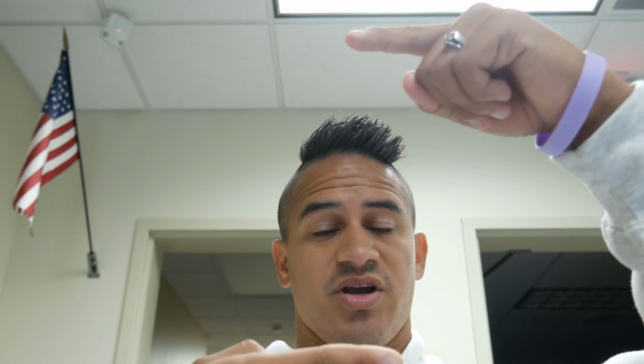So all of these, to be honest, would probably work just fine, but the best one would probably be a 10 milliliter graduated cylinder, because 10 milliliters is about this big, and each little marking on there is going to give you a lot closer measurement to 8 milliliters, whereas if you put it in a 100 milliliter graduated cylinder, which is much bigger, I think you maybe only have markings every 1 milliliter, whereas on a 10 it might be every half a milliliter. So it would be best to use the graduated cylinder that is closest to the amount of volume that you're trying to measure.